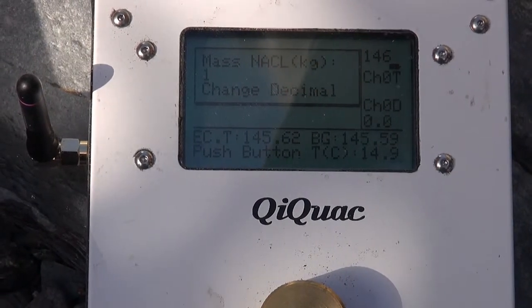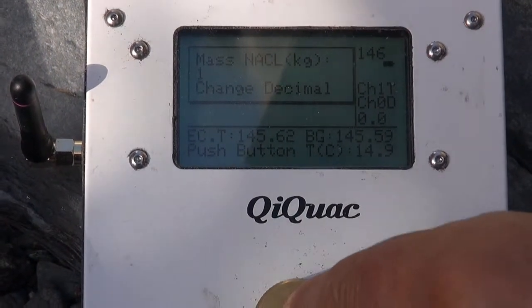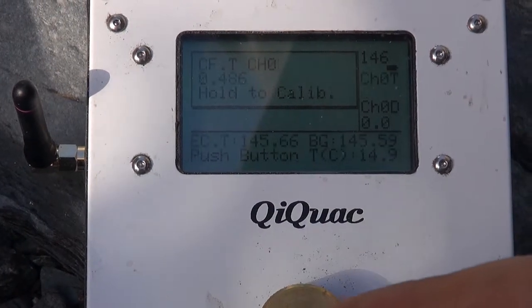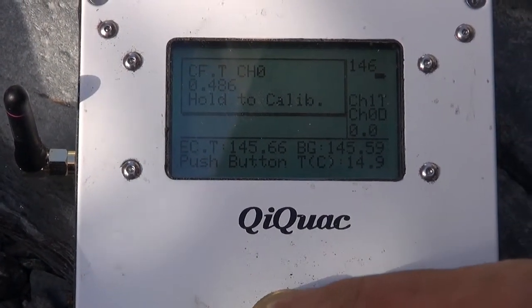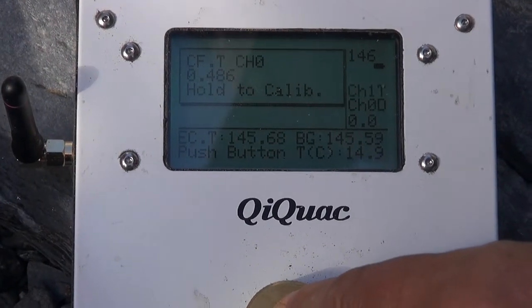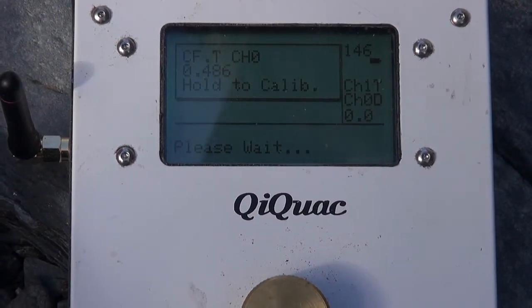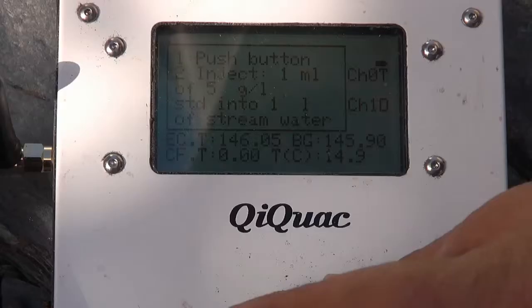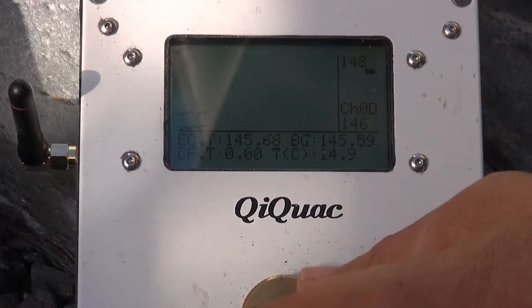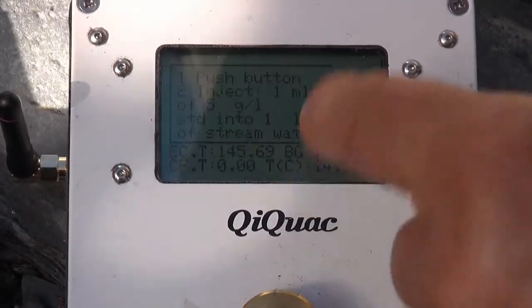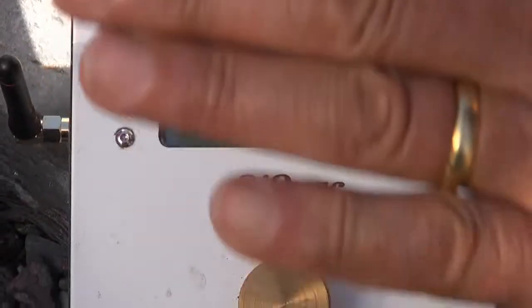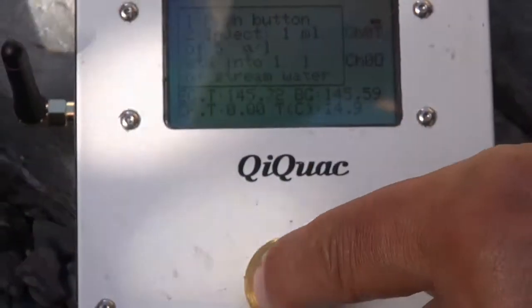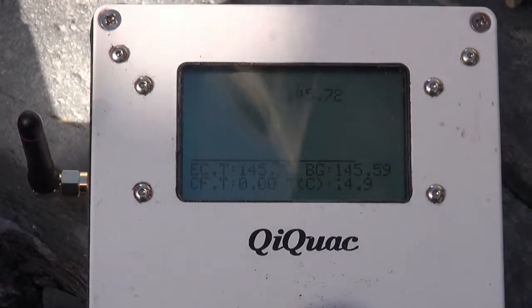Change decimal, no, press that again, hold to calibrate. We want to calibrate it, so we press it and hold it, and let it go. It's waiting. 145.68, so it's pretty close together. So now we want to push the button to have that background reading, there it is there.